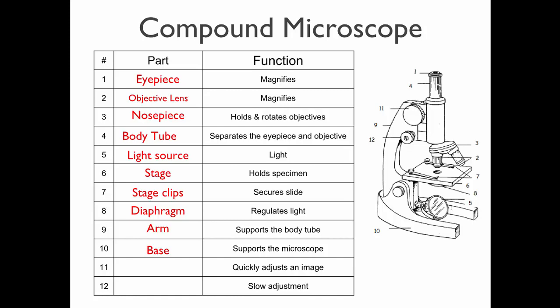And people often mistake what they're for. So you can see when I turn this knob, what's moving? It's the stage. The stage is moving up or down. Same thing here. It moves the stage up or down.